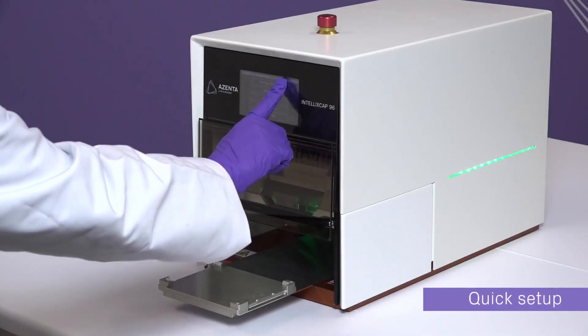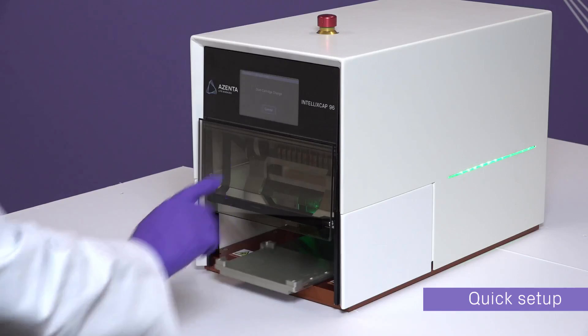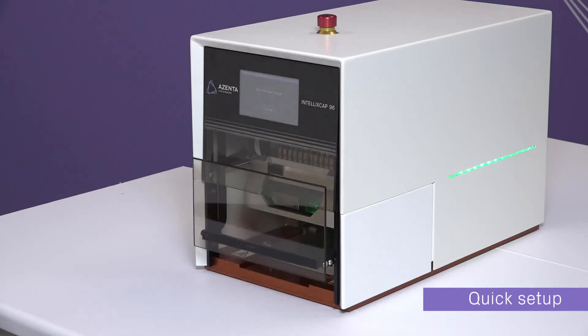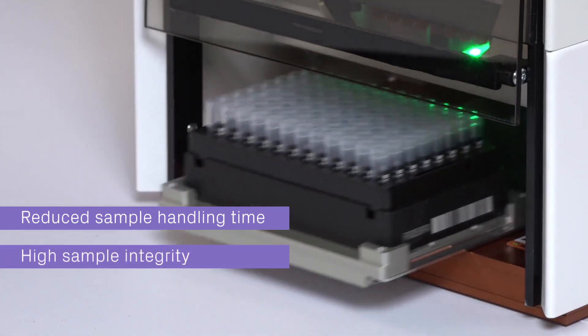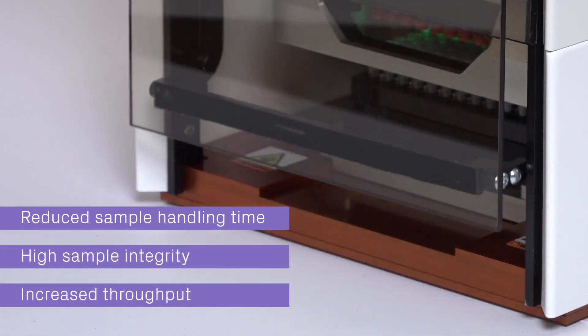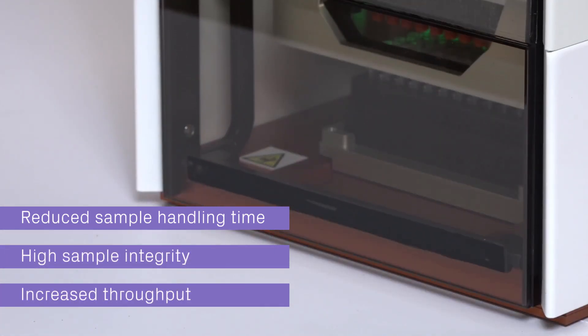Quick to set up and simple to control, the IntelliXcap delivers fast, accurate, and flexible automation. The result? Reduced sample handling time, higher levels of sample integrity, and increased throughput for your laboratory, ideal for integrated or manual workflows.